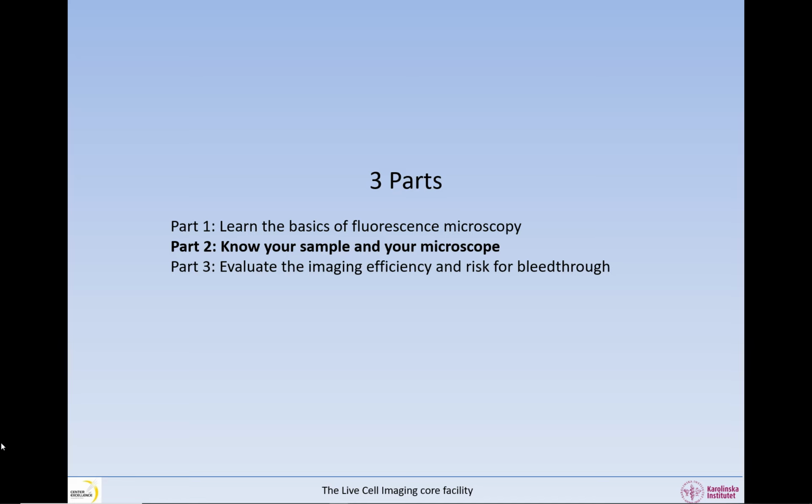This is the second part of 3 videos. In the first video, you've learned the basics of fluorescence microscopy, and in this video, you're going to learn how to know your sample and your microscope better.